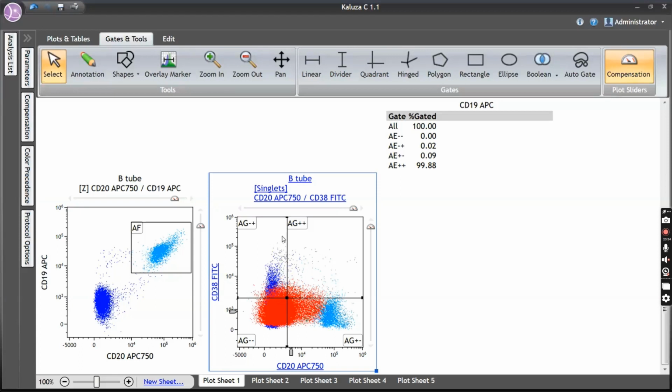Plasma cells will show bright CD38, but you don't find plasma cells most commonly in acute leukemias, because the marrow will be totally occupied by blast and few lymphocytes. So plasma cells will not act as an internal positive control for you. So you should take T cells, which is again an activation marker. So you see it is almost in the negative quadrant. Okay, so CD38 is negative.